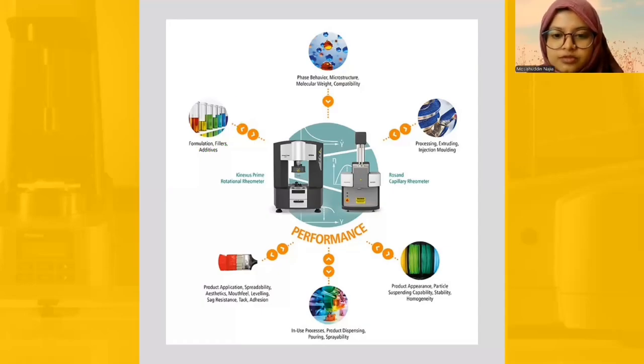It's examined to see the formulation, filler, additives, etc. Then in molecular studies to see the phase behavior, microstructure, etc. And others include industries like processing, then product appearance, what is the particle suspending capability, what is the stability, how is the homogeneity of the product, and also the spreadability and product application, etc.